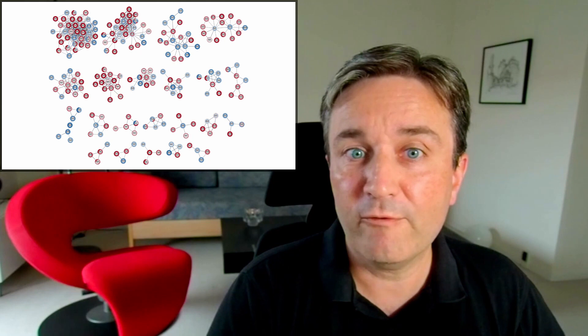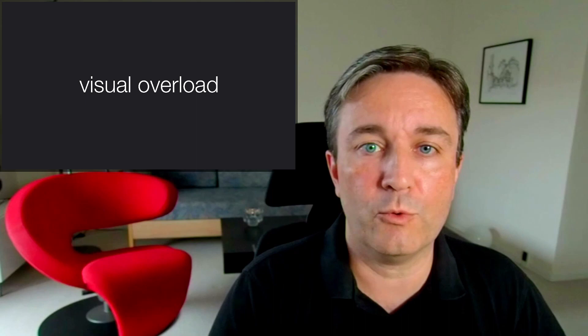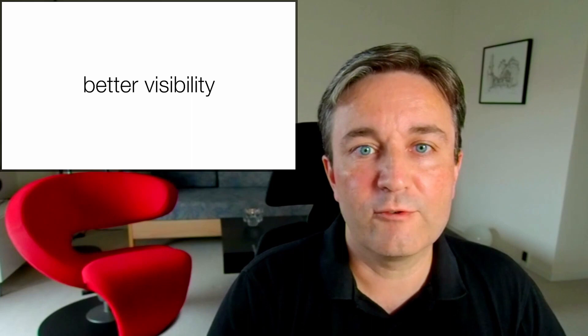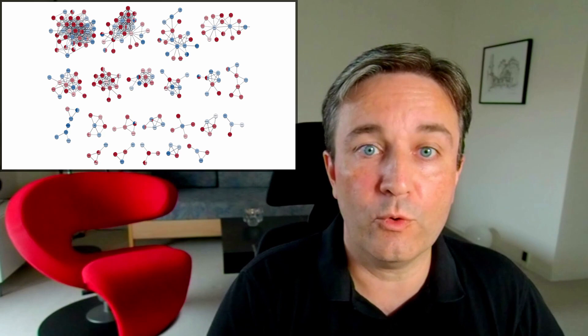However, even the simpler version tends to lead to visual overload for very large networks. For this reason, I recommend using the pie visualization instead, since it gives better visibility of the data when having smaller nodes. Here you see the same network shown with the pie visualization instead of the donut visualization.